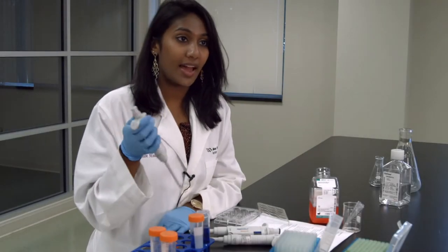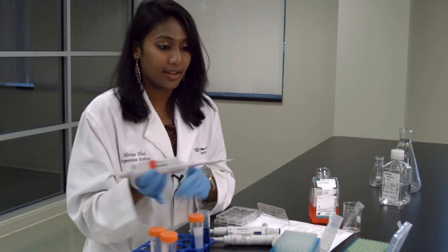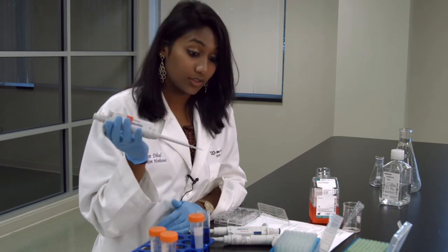One trick for pipetting the accurate amount — and this is especially important for smaller volumes, such as anything from 1 microliter to 10 microliters, but you can also use this trick for all of the micropipettes as well. For example, I'll be micropipetting 5 microliters of liquid.